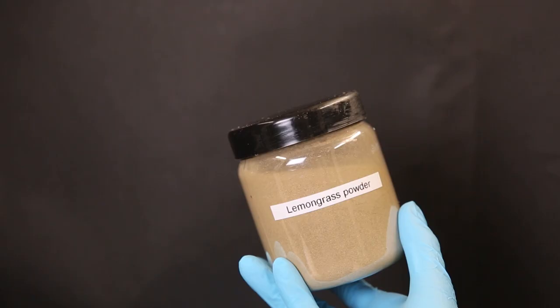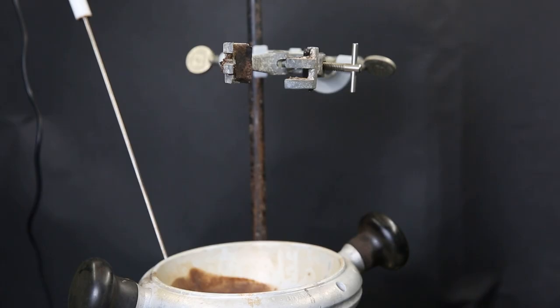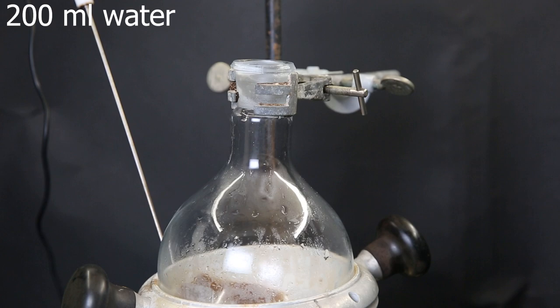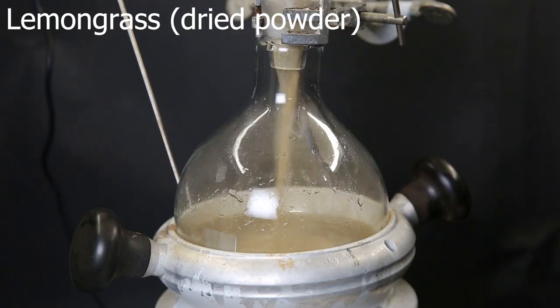So to get started, I bought dry lemongrass powder online, so the volume of lemongrass wouldn't be too much. But the same process can also be done on dried or undried lemongrass. So I set up a heating mantle and then place in a large flask. I then add in 200 mils of water, put on a funnel, and add in 175 grams of lemongrass powder.